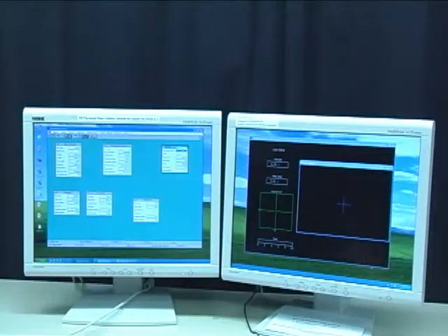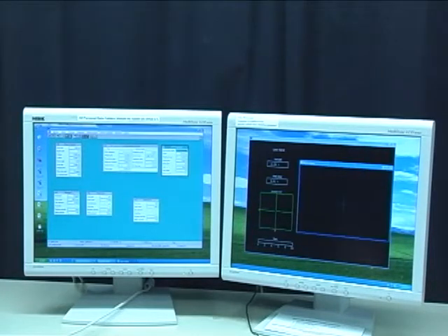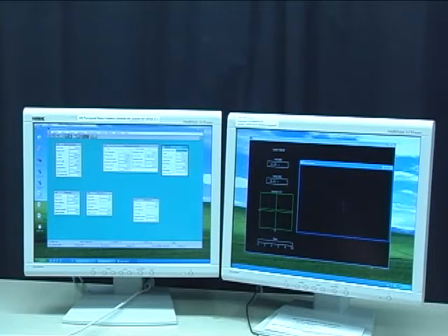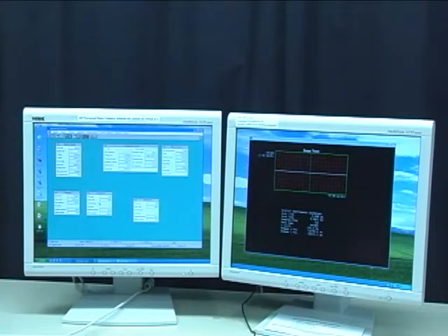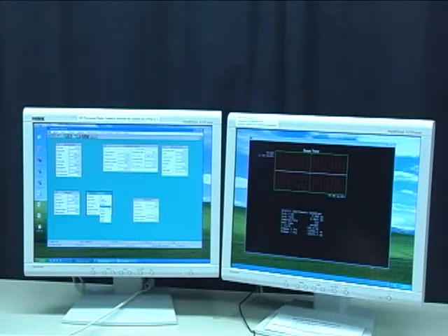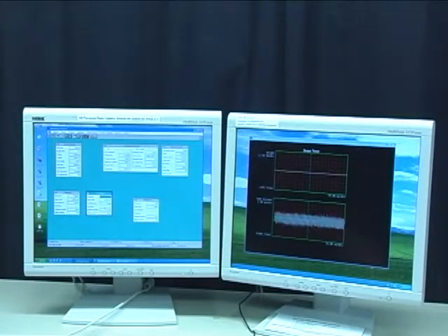We start by setting the microscope mode into the TUNA mode which is the tunneling AFM mode. And then to calibrate our amplifier we will use the oscilloscope mode which allows us to directly view the signal from our amplifiers. We'll turn on channel 2 as the TUNA current and select the appropriate current sensitivity range. For our experiments we usually use the 1 nanoamp per volt range.